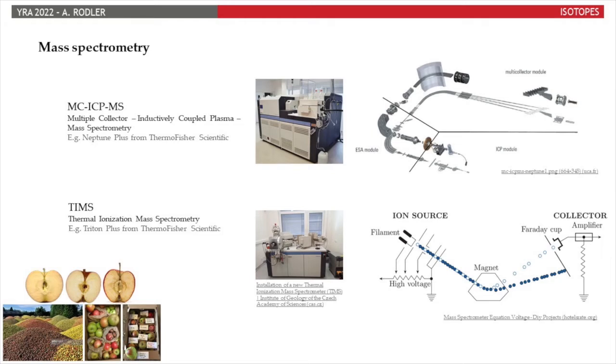We'll get out in a detector the different masses of the element of interest, the different isotope masses, so we can calculate what the ratios of different isotopes to each other are. And this can then be used to infer where, for example, raw materials came from when comparing to reference material that we know of already.